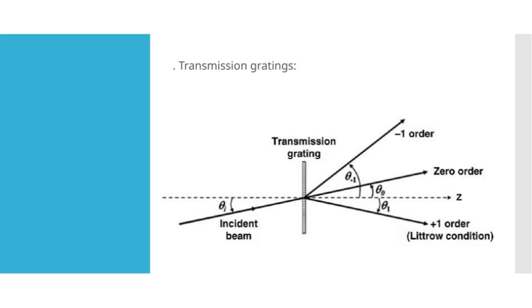What's particularly interesting is how they connect to the overall theme of optical systems, improving measurement accuracy and enabling detailed analysis of light sources. By carefully designing the groove spacing and profile, we can tailor these gratings for specific wavelengths or spectral ranges, enhancing their versatility in various scientific and industrial settings. So, in essence, transmission gratings are fundamental tools that allow us to dissect light with remarkable precision, helping us better understand the properties of different light sources and materials.